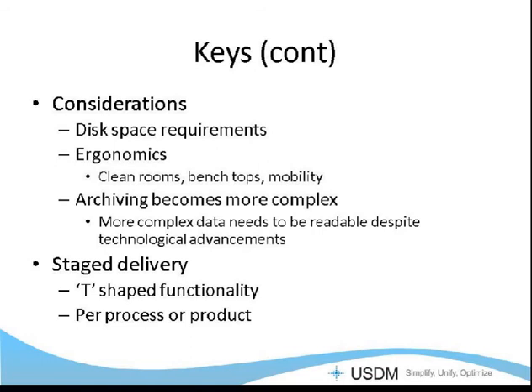Some things that have helped me is what I call a T-shaped functionality implementation. Basically, this means you implement a high level of the entire system without going very deep into the functionality of each area. So get the basic system in, and then as you go along, you might add in calculations. You might add in spec pulls from LIMS. You might add validation of result entry. You might add sending out of results to LIMS, but the basic functionality gets in there first, and then in stage delivery, you add deeper and deeper functionality.